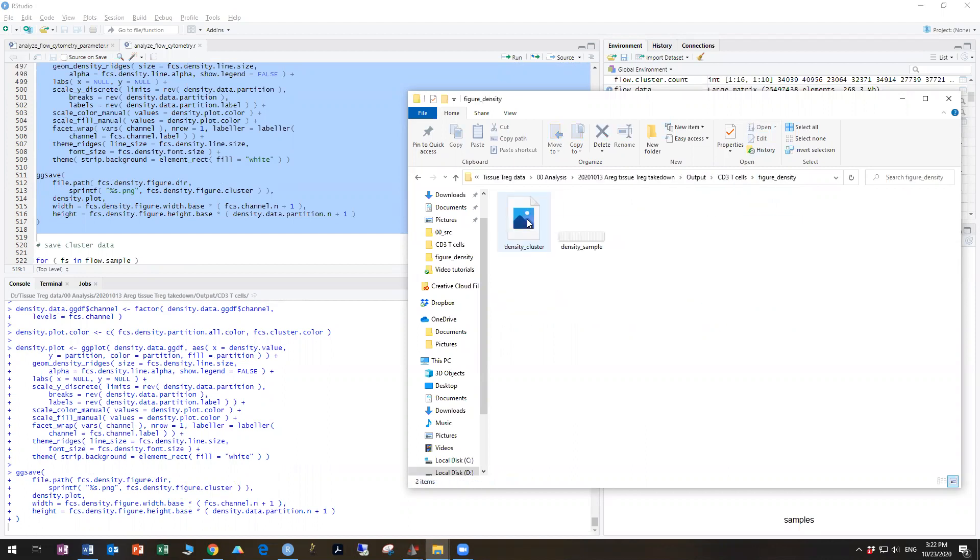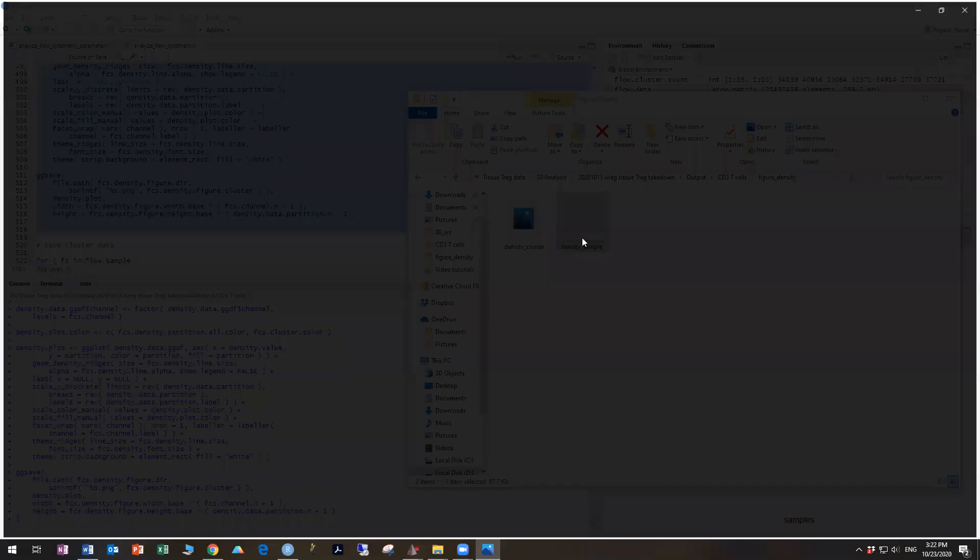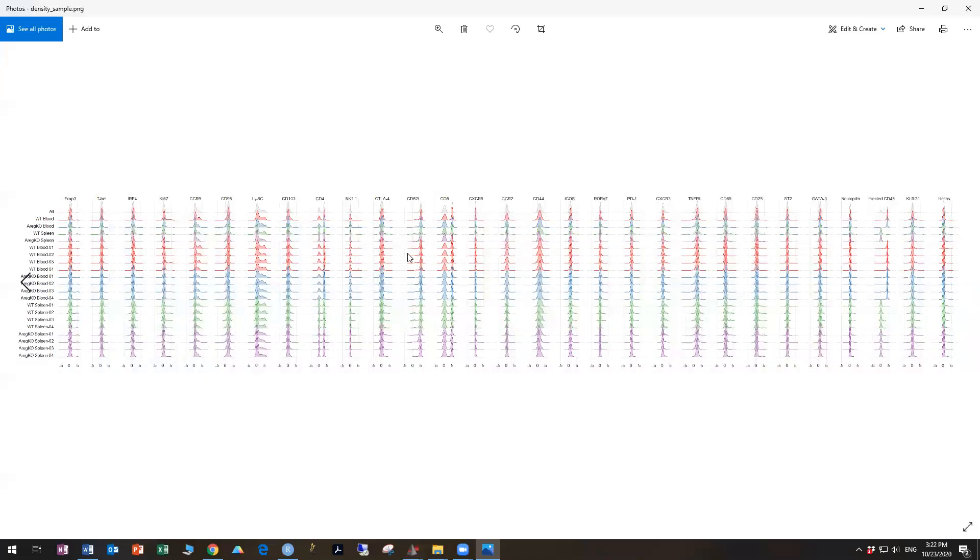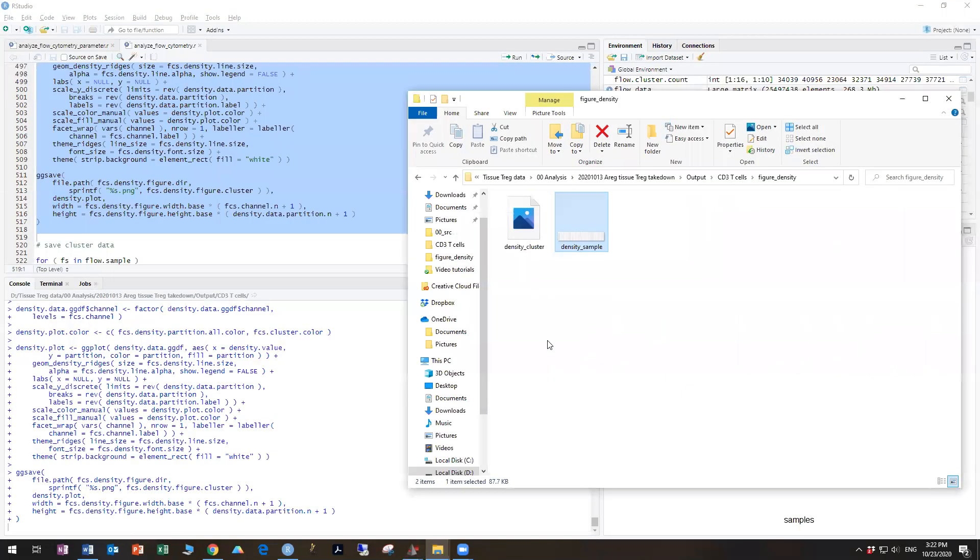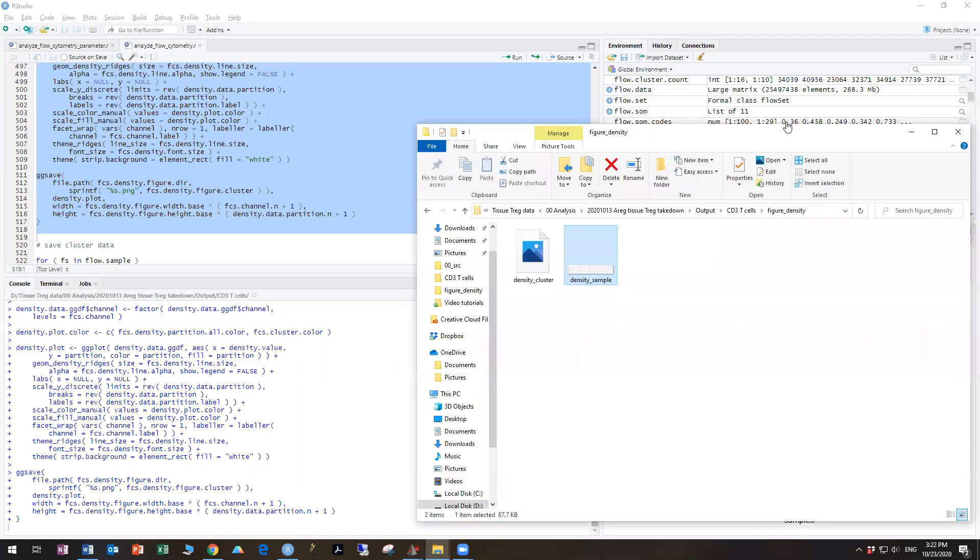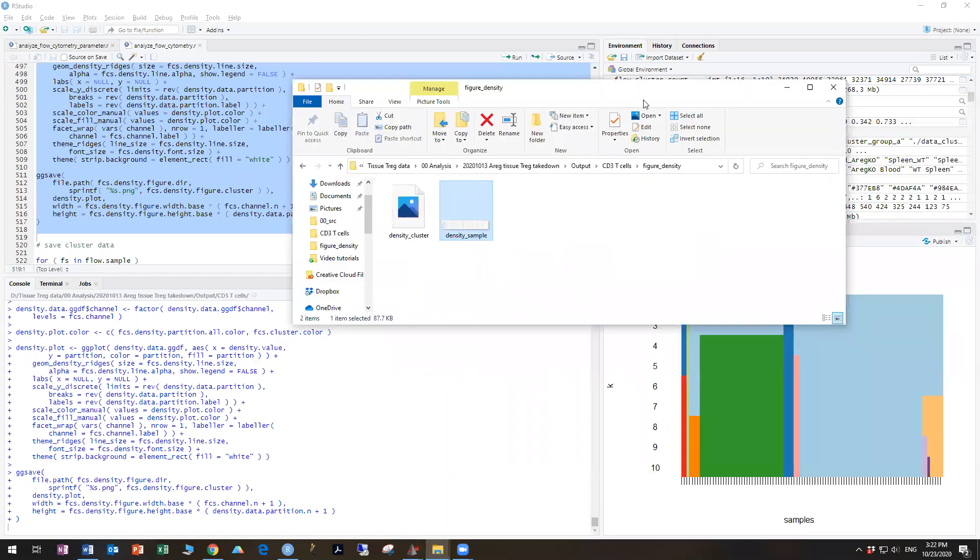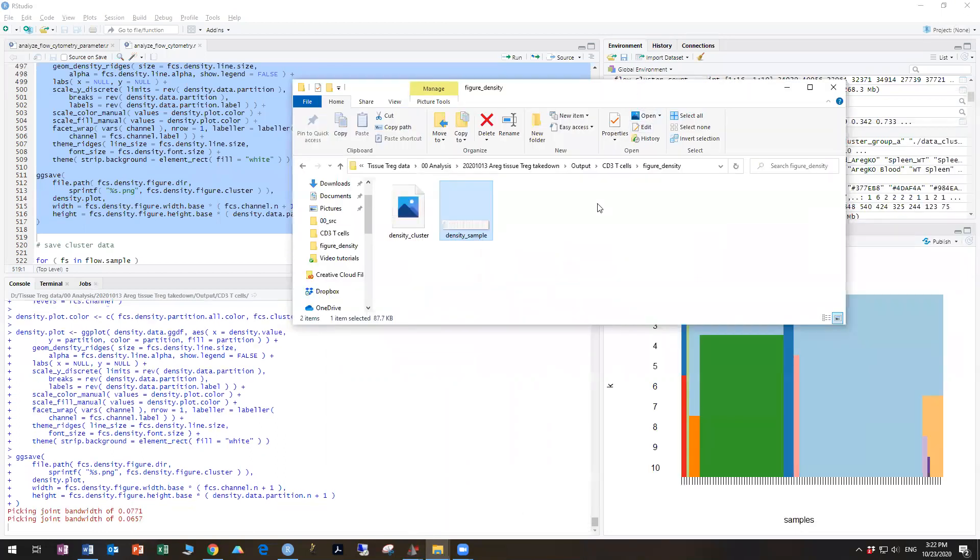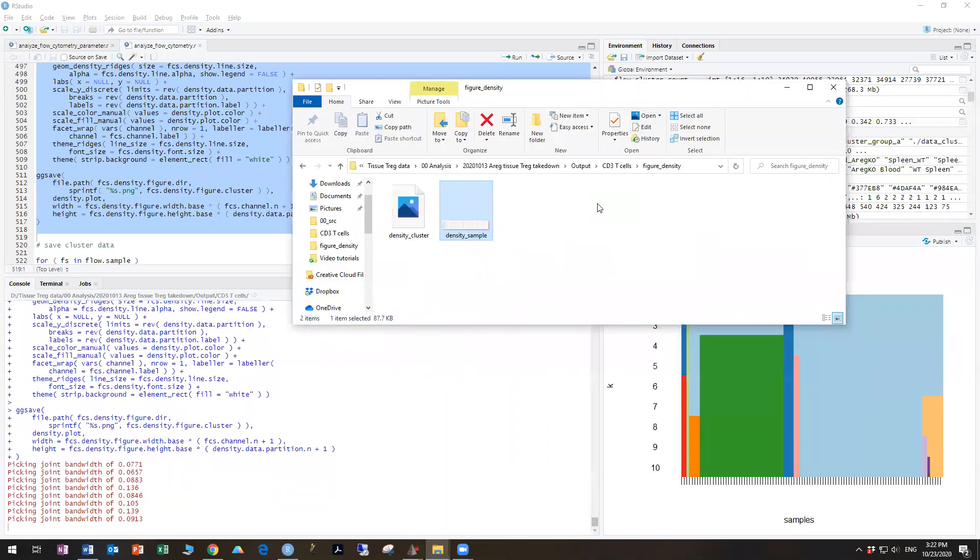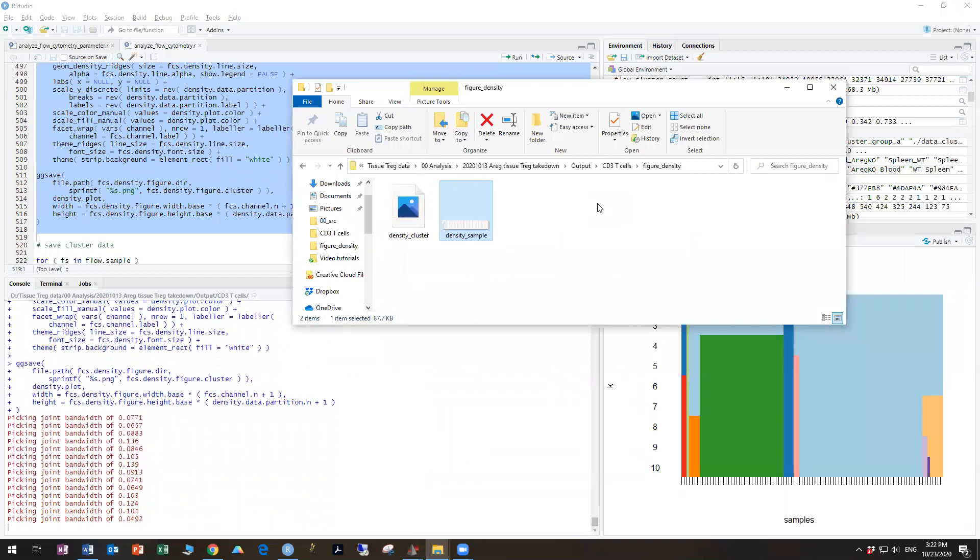So if we go into density, you can see we have our density figures, density samples from before, which we're looking at by individual flow sample. And it's still working on the other one, but this one will be by cluster. So we can say those clusters one through 10, what markers are expressed on each one.